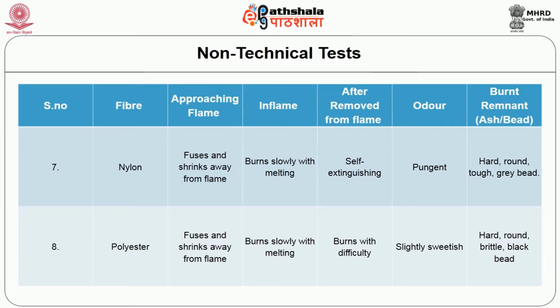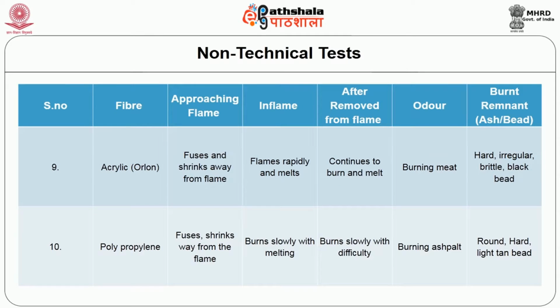Regarding polyester, while approaching the flame, it fuses and shrinks away. In the flame, it burns slowly with melting. While removing from the flame, it burns with difficulty. Regarding odor, it is slightly sweetish. Regarding the bead, it's a hard, round, brittle bead. The color is black.